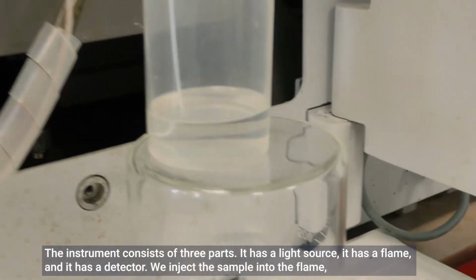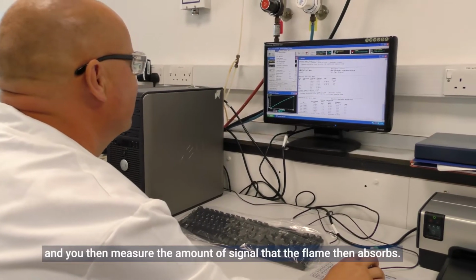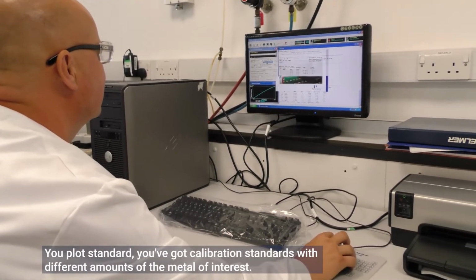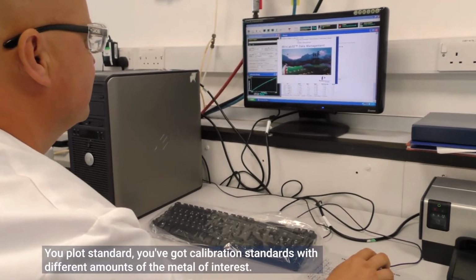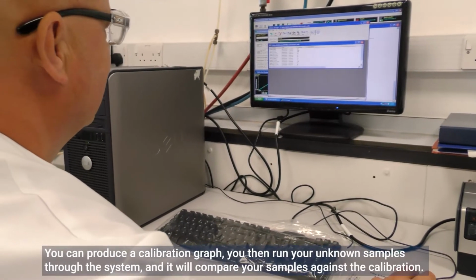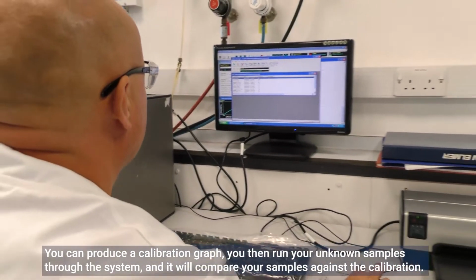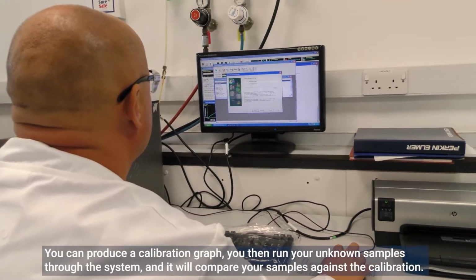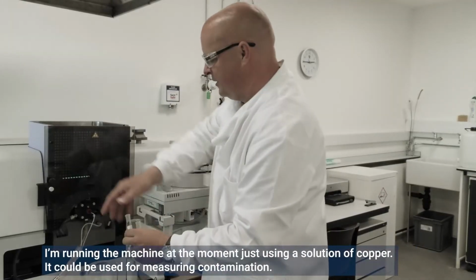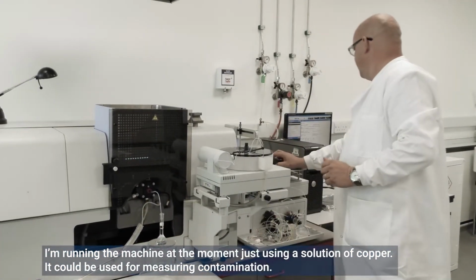We inject the sample into the flame, and you then measure the amount of signal that the flame absorbs. You run calibration standards with different amounts of the metal of interest, and you can produce a calibration graph. You then run your unknown samples through the system, and it will compare your samples against the calibration. Actually running the machine at the moment, just using a solution of copper.